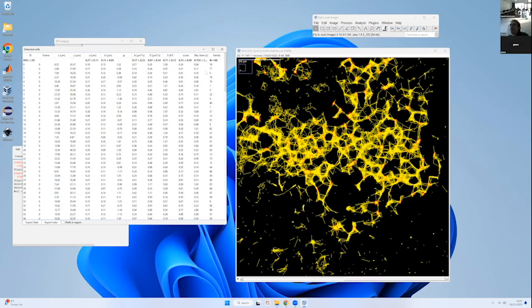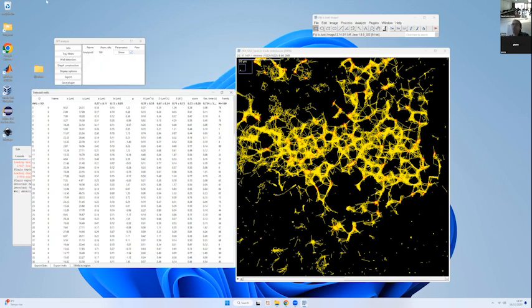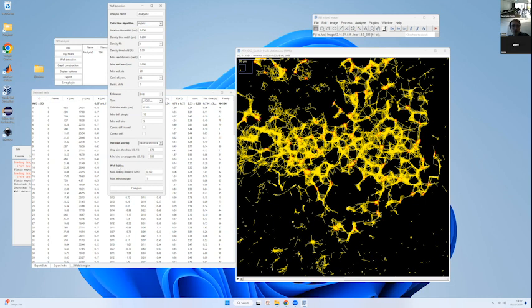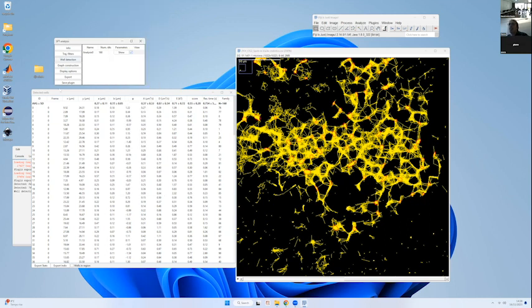All right, finally, the last thing you have in the table is the family. So the family is just to follow wells in different time windows. There was an option when we detected the wells that was called well linking. Basically, we consider that two wells that appear less than 100 nanometers apart in successive time windows will be in the same family. So if you're in the same family, you're the same well in time.